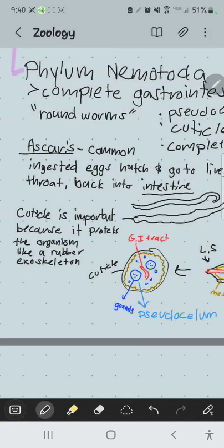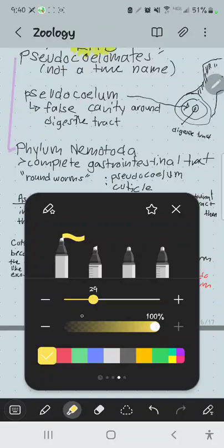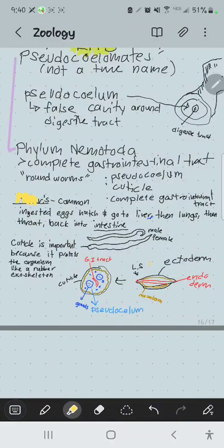So we say Ascaris is an intestinal worm. Enterobius are also intestinal worms, but more accurately they're called pinworms. And so pinworms are Enterobius. I would like you to know the common name of these parasites, because it also tells you a little bit about how you get them. Pinworms are a common parasite in children, even in Shasta County and the Redding area.